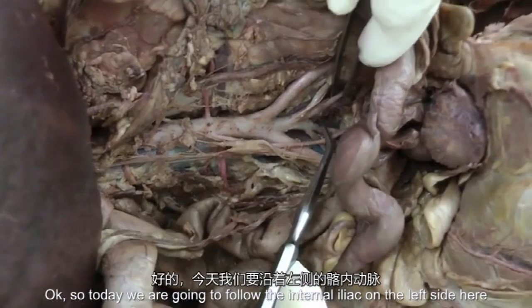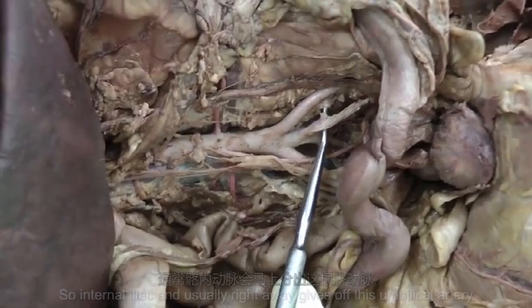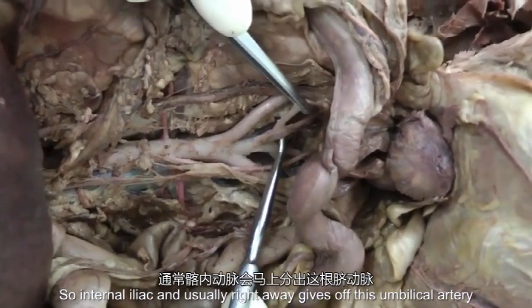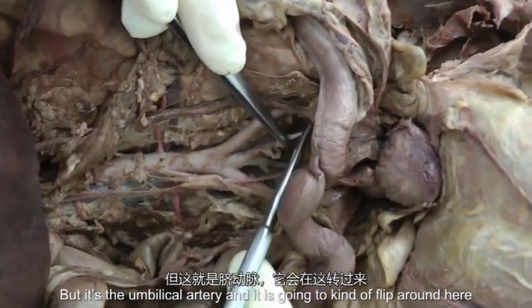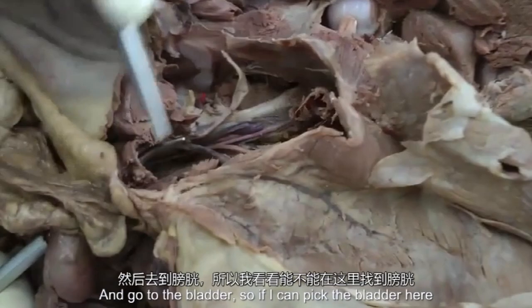Today we're going to follow the internal iliac on the left side. The internal iliac usually right away gives off this umbilical artery that kind of looks like a nerve, and may not look like an artery, but that's the umbilical artery. It is going to flip around here and go to the bladder.